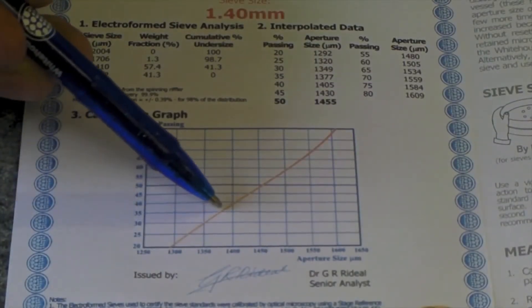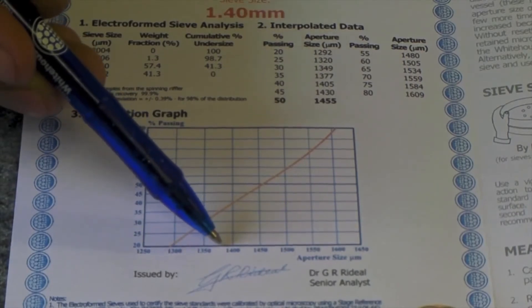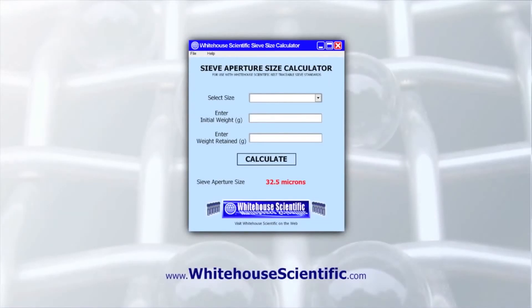Using the calibration curve provided, read off the mean aperture size of the sieve. Alternatively, use the free sieve aperture size calculator available from White House Scientific.